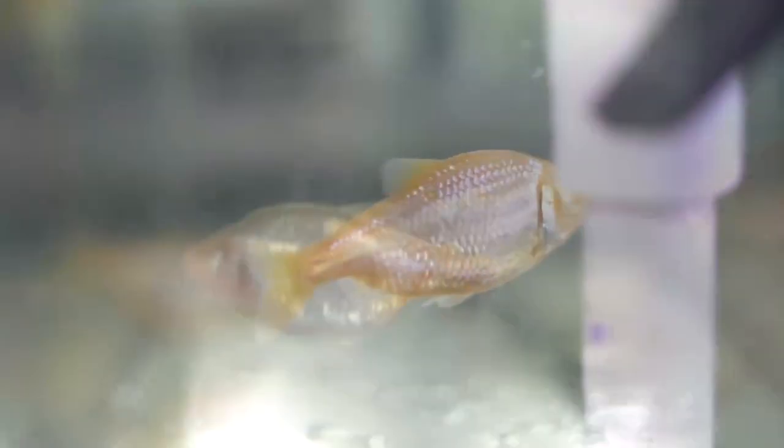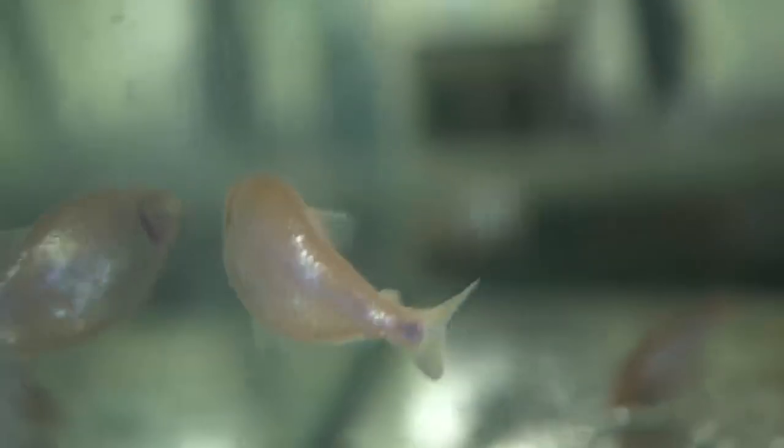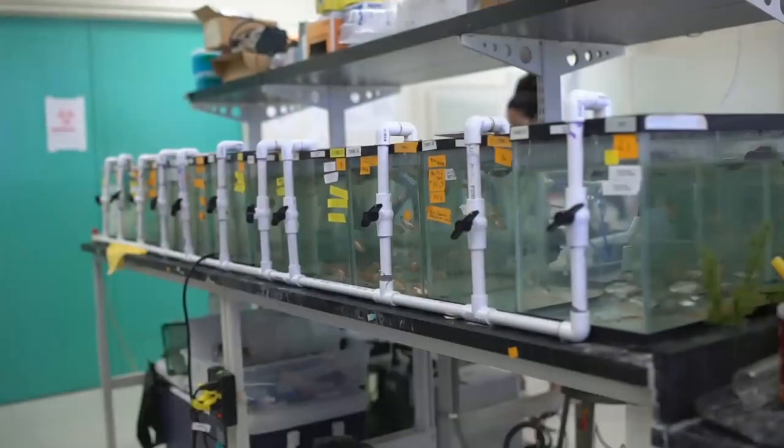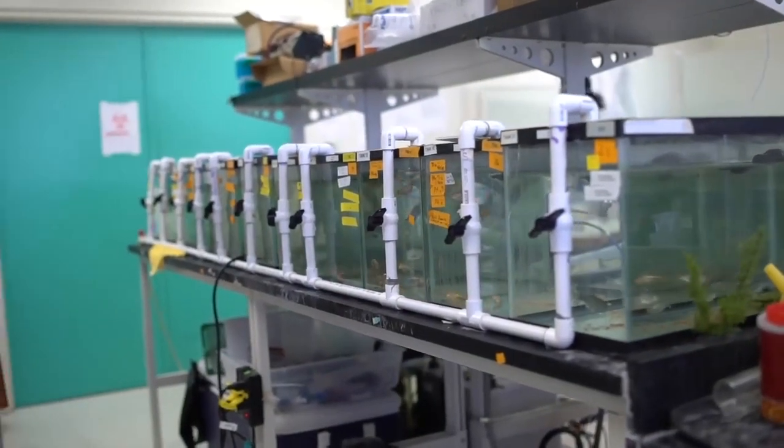Here, we will show the battery of behavioral assay and analysis systems that can be used for both evolutionary and biomedical studies.